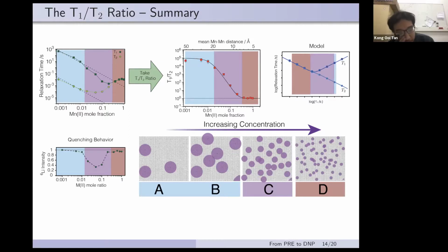And I think you showed the measurement that you did when you spin at 60 kilohertz, if I'm not mistaken. Yes, these are 60 kilohertz, room temperature. And how would it change if you go to like 10 kilohertz spinning, which is the case you use for DNP, right? How would this value change when you spin slower?